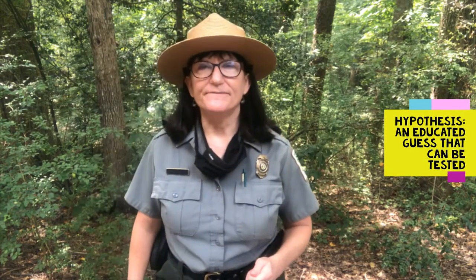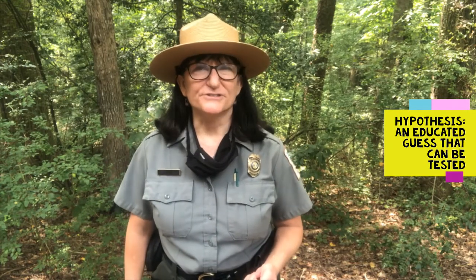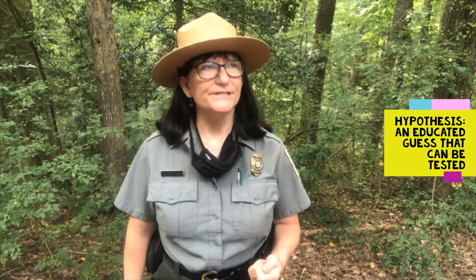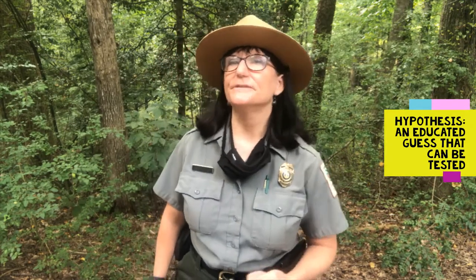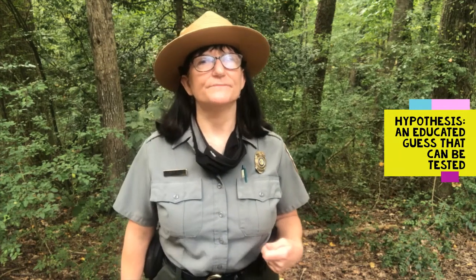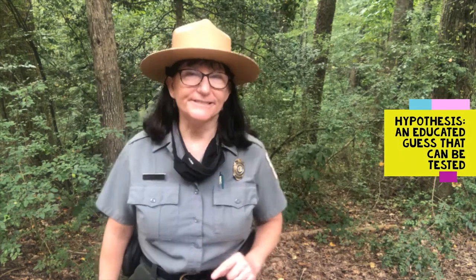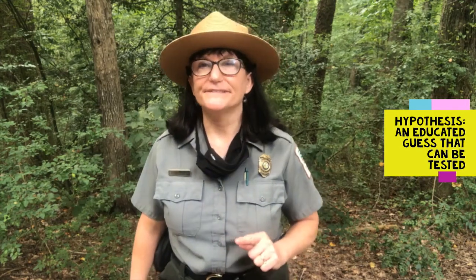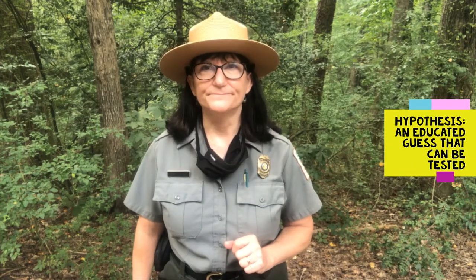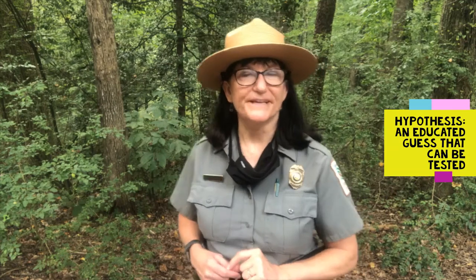How about orange juice? Have you ever noticed that fruit juices can cause your lips to sting a little and water doesn't do that? We might ask the question, since fruit juices cause our lips to sting and water does not, could that be because fruit juices are more acidic than water? And then we can sound like a good scientist and make a hypothesis statement saying fruit juices are more acidic than water. Now, to find out if that's true, we're going to measure the pH, right?